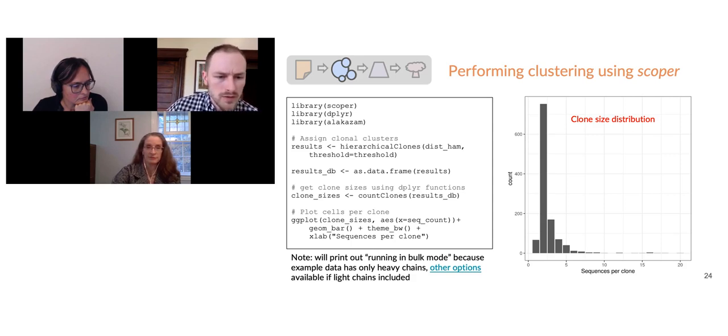Okay, I'm using 10x single-cell genomics and later using FASTA annotation to run IG-BLAST sequencing alignment, but I know the Cell Ranger pipeline doesn't arrange all of the VDJ BCR sequences correctly. So how do we rearrange it so it is correct, and would you recommend quality control on the BCR data before classifying clonotypes?